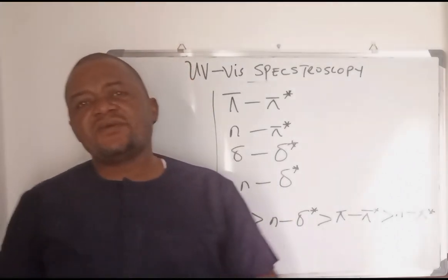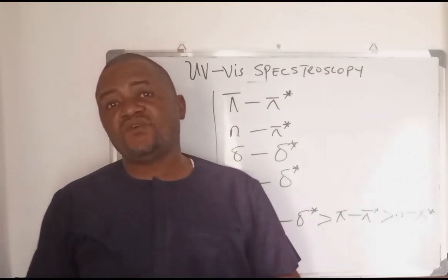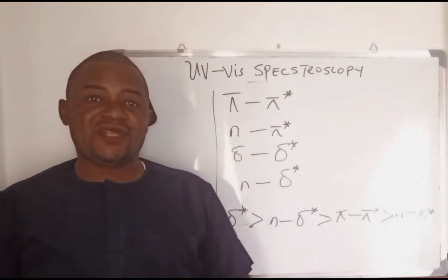Now, this is how the principle works. We are going to look at how the instrumentation of UV visible spectroscopy goes in our subsequent class.